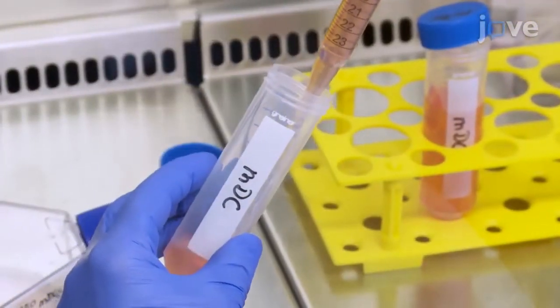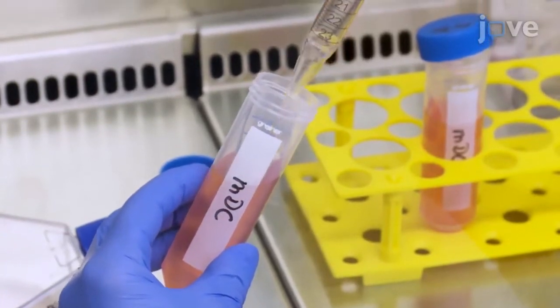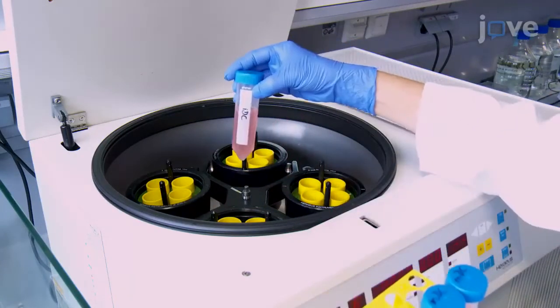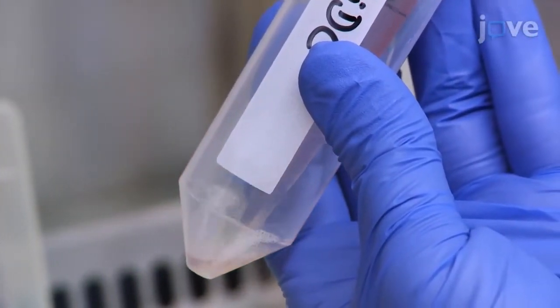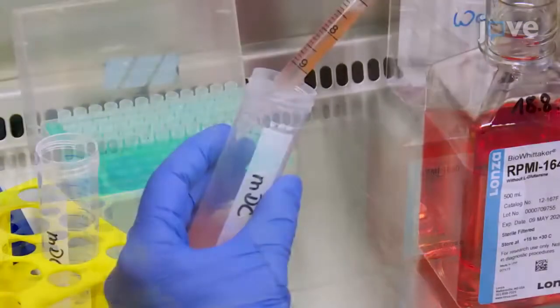Repeat the rinse twice, then transfer the IDCs and MDCs to 50 mL tubes in their respective culture medium. Harvest the cells via centrifugation at 300 times G for 5 minutes. Gently resuspend the cells in 5–10 mL of RPMI 1640 per cell culture flask, and combine the respective DC suspensions in one tube.